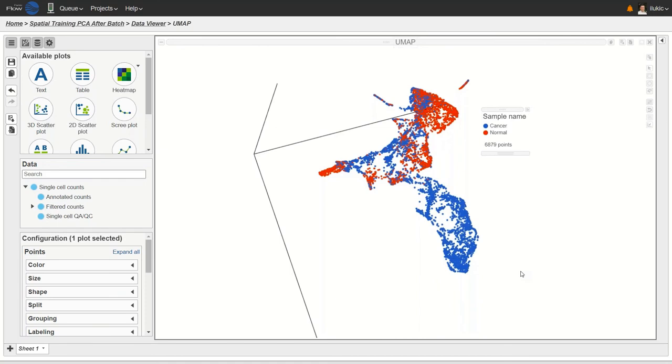In other words, we're now going to talk about classification, right? So how can I classify my tissue spots into cancer or normal? There are several ways to do that. For example, I can be guided by my exploration. Say, okay, over here, these are my cancer tissue spots, and then I'm going to revert the selection, and this is my normal tissue. Or I can use an algorithmic approach to first detect any structure in the data and to make the decision where to draw the line.